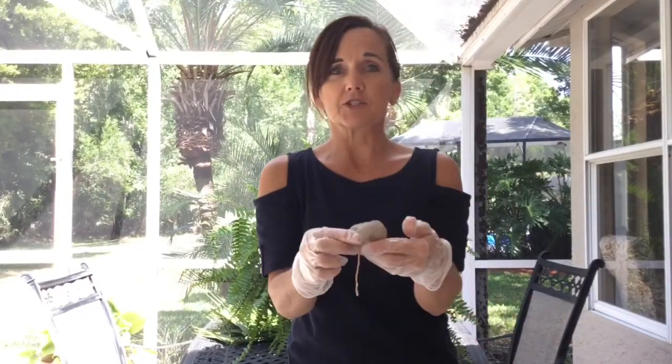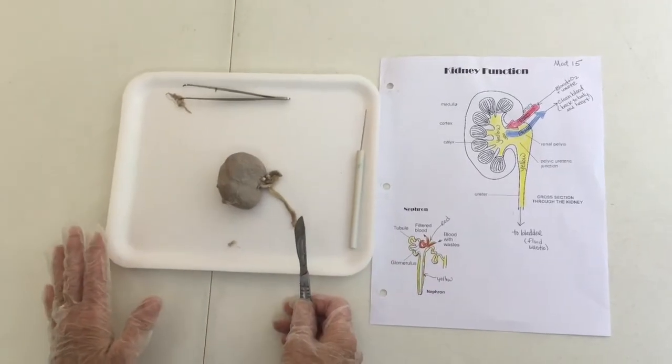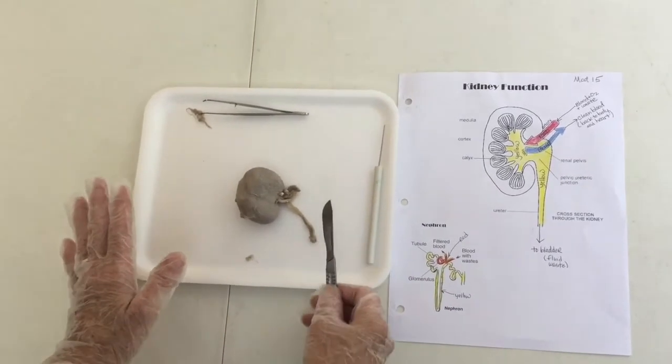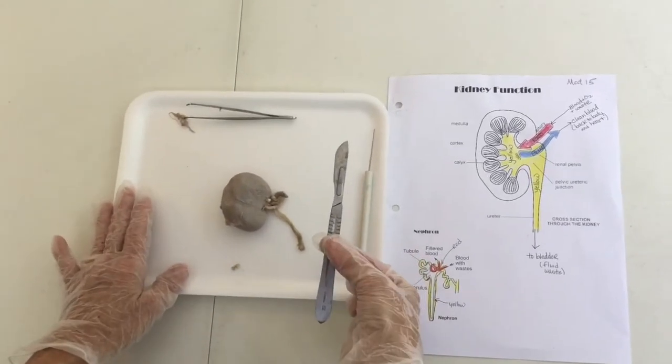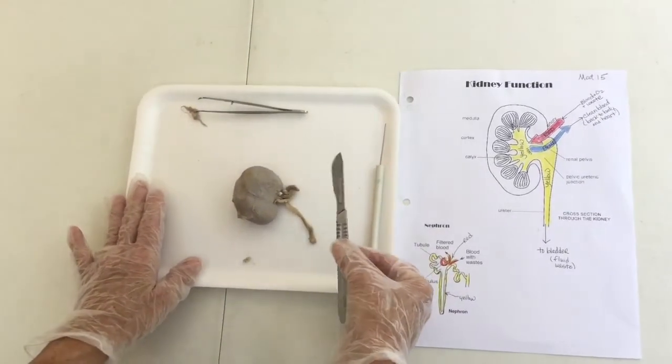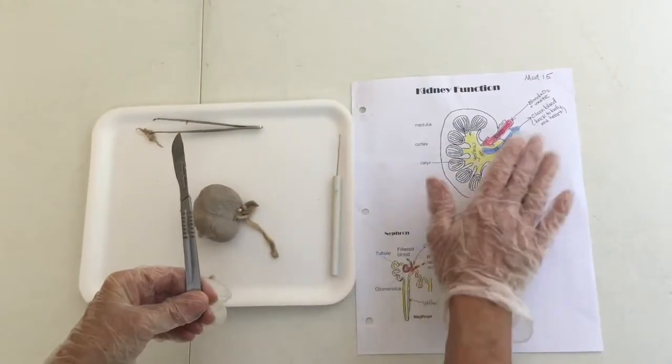Let's get ready to cut our kidney open. If you have a kidney at home that you're dissecting, follow along. If not, just watch and observe. We have our dissection tray, a sharp scalpel for cutting, and our diagram that we're learning from today. We did color code it for a reason.